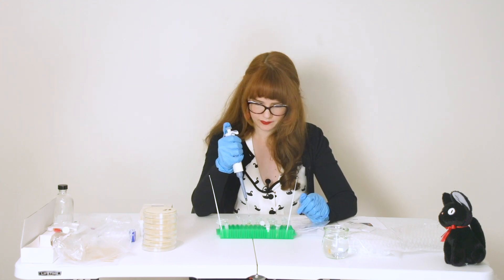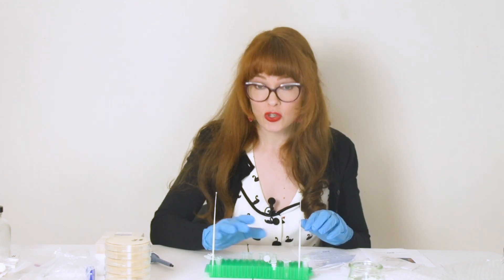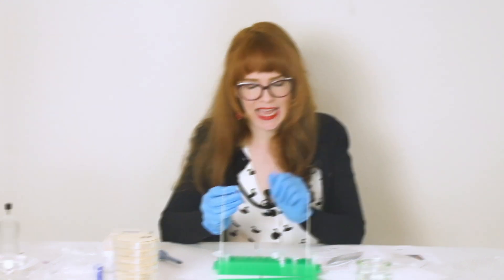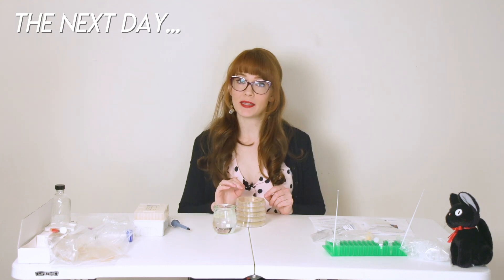We have five micro centrifuge tubes that now have the YPD mixture mixed with the competent cell mixture with the DNA. I'm going to take my transformation mix and pour it on top of the agar plate.